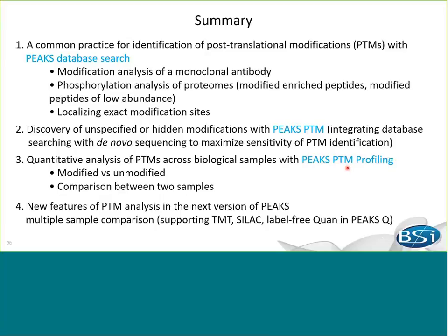And also I have showed you some new features related to PTM analysis, which will be implemented in the next version of PEAKS. And we hope that the information we provide you today can help you better perform your PTM analysis by using PEAKS software.